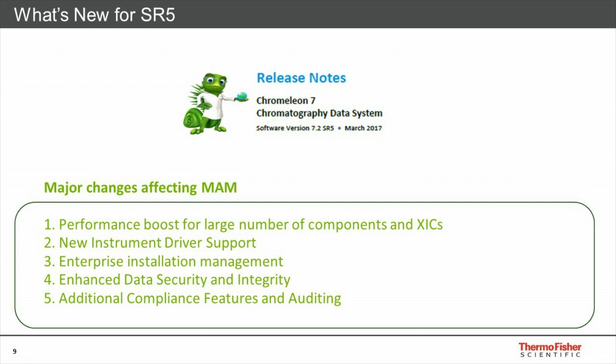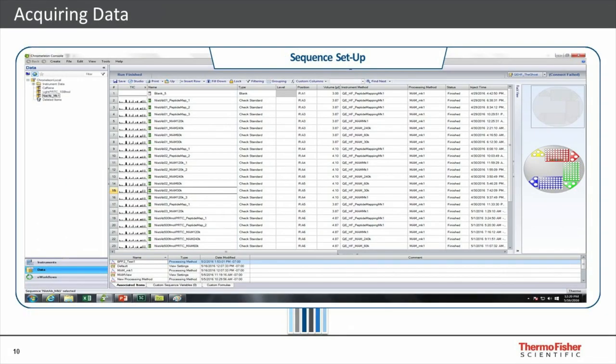So this means that nobody can swap in and out a raw file, rename it, cut it, slice it, say, you know what? This first injection kind of was bad, I want to swap it for another one. That's impossible. It will do a checksum on the data, and if the checksum doesn't match, it will put a red X and say this data has been tampered with, essentially, and won't integrate it.